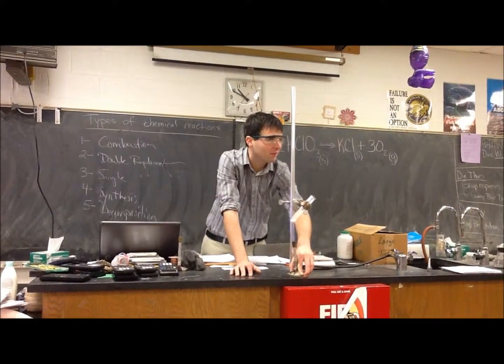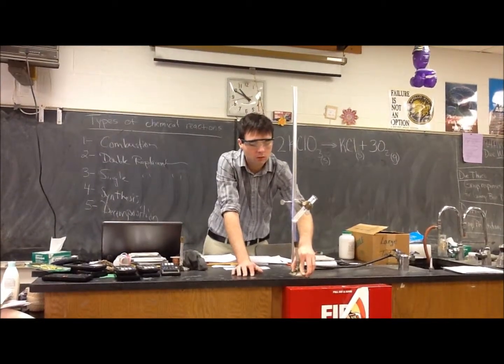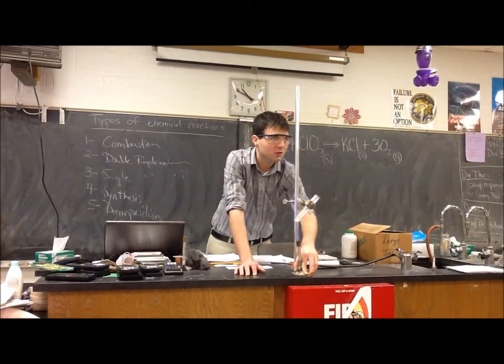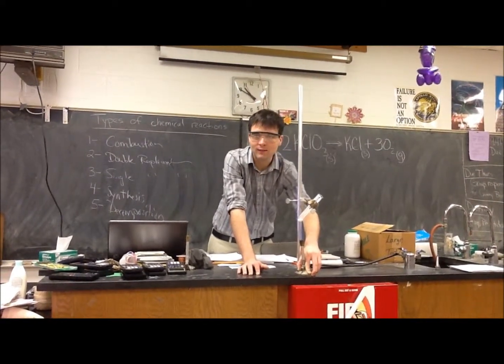Wow, not much is happening, is it? Nope. Oh, I see a few things. I see some bubbles. What does it mean whenever we have bubbles? Oxygen's released. I heard a bunch of you say the same thing, but different ways. I heard oxygen gas is coming out. That's correct. That's exactly what's happening.